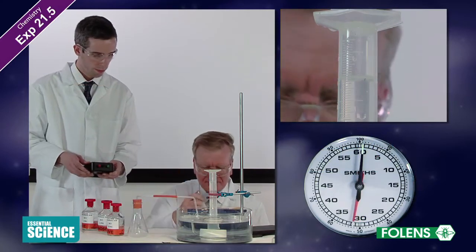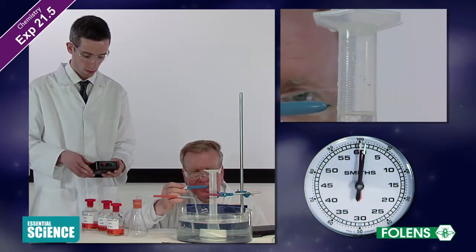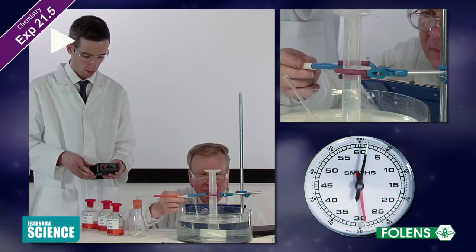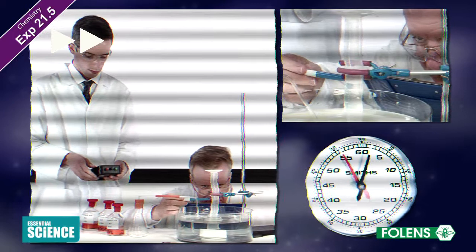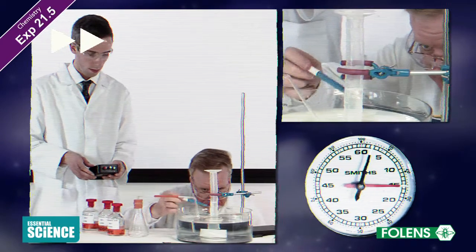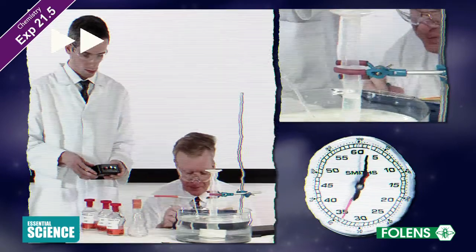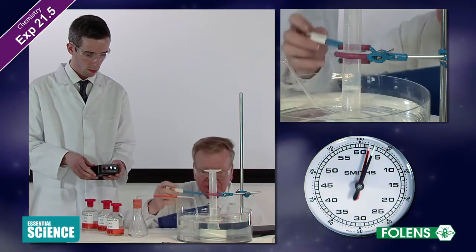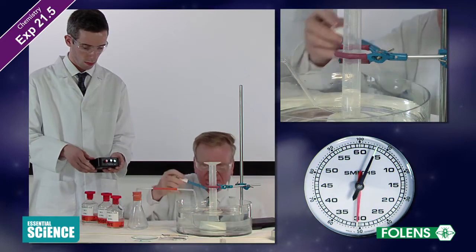30 seconds. 60 seconds. 90 seconds. 120 seconds. 150 seconds. 180 seconds. 210 seconds.